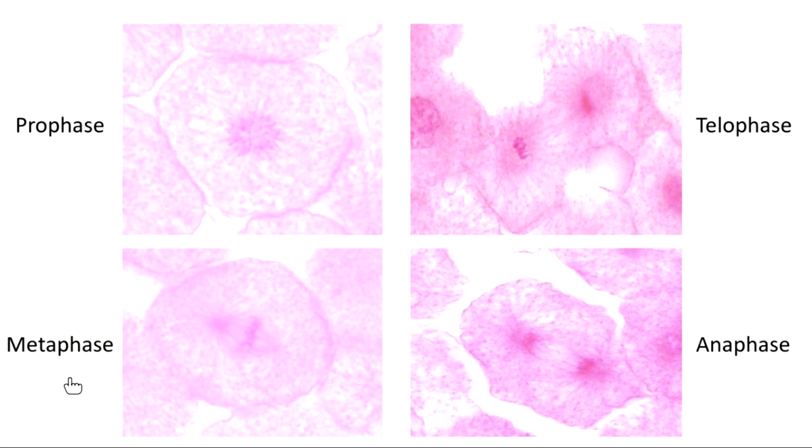Remember, I told you that metaphase is the phase that's probably going to be the easiest for you to identify, because in metaphase, the chromosomes meet in the middle of the cell. So see this line of chromosomes here where they're meeting in the middle of the cell? This whole thing, by the way, all of this is a cell. So inside that cell, now I've got that line of chromosomes. You can kind of see those green proteins from my previous pictures, going from those centrioles, attaching out, my mitotic spindle that's pulling on these chromosomes here in the middle. So here I am in metaphase. I've got a line of chromosomes in the middle of a cell.